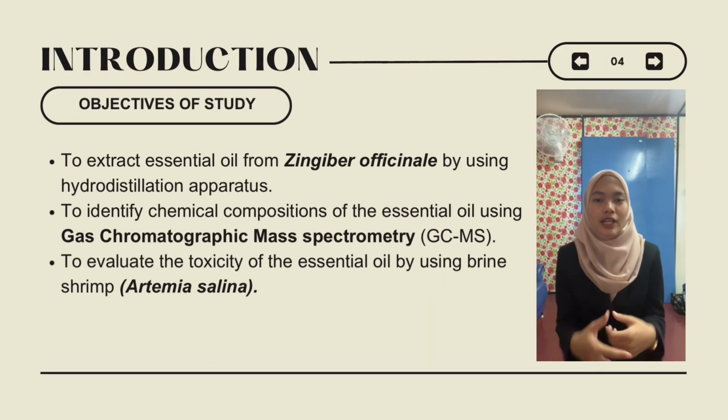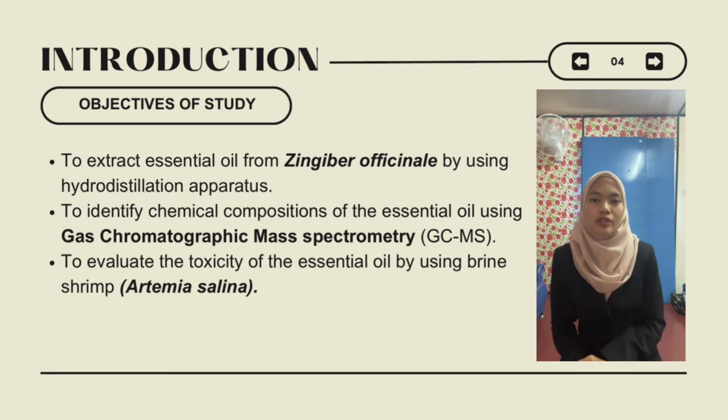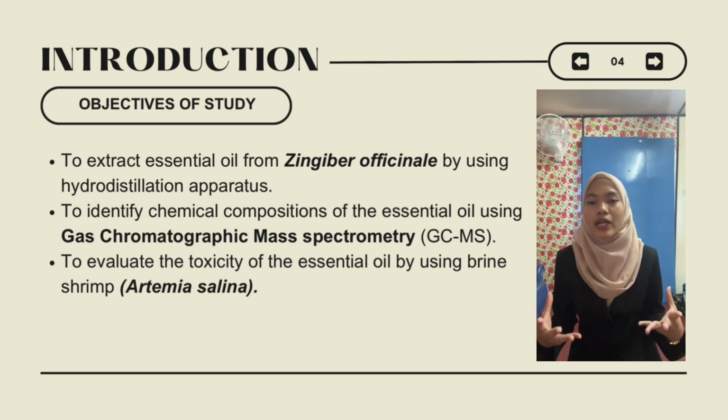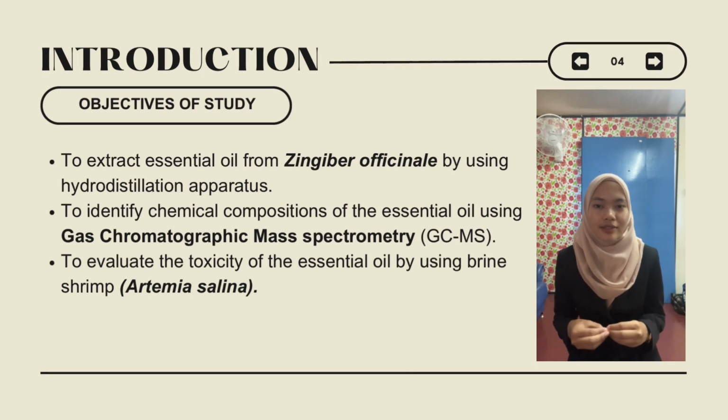The goals of the study are, first, to extract essential oil from ginger by using hydrodistillation apparatus. Second, to identify chemical compositions of the essential oil using gas chromatography mass spectroscopy. And lastly, to evaluate the toxicity of the essential oil using Artemia salina.